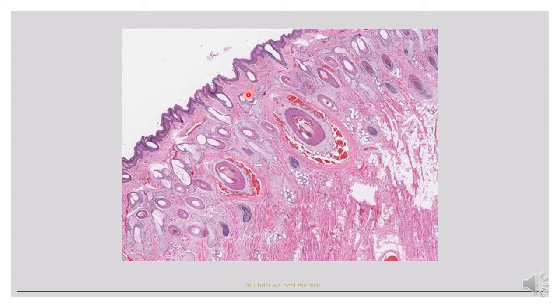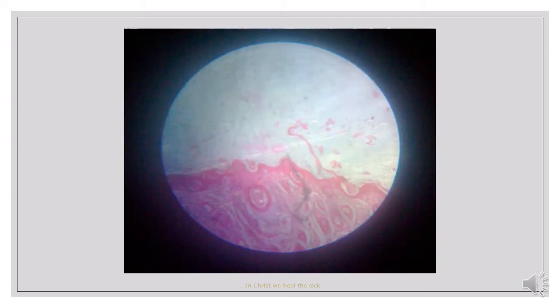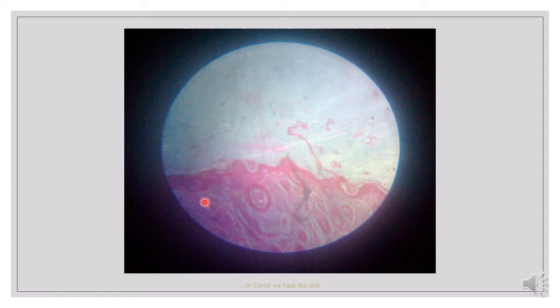Here we have the same situation. There is no part of the slide that is devoid of hair follicles. You can see hair follicles here, here, and even in this part. So this slide also shows just the skin side of the lip.